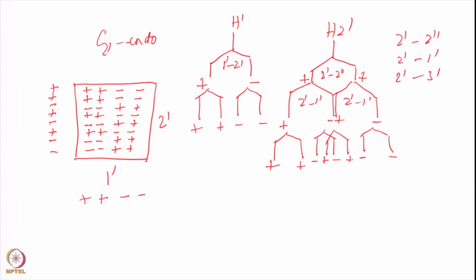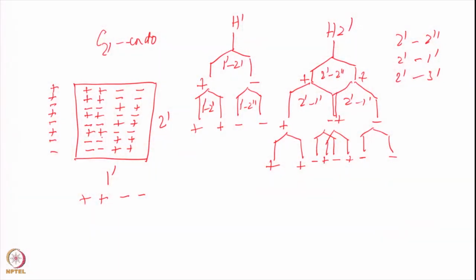This is the coupling, this is the 1' to double prime, 1' to double prime. So by looking at these plus minus separations, you can figure out what the coupling constants are in each one of those. Okay. But often you may not be able to resolve the peaks in this manner. So what will happen? There will be cancellations in the middle, all pluses and minuses will cancel in the middle, then you may not be able to find all the peaks. So in such a situation what do you do? When we do not have this, of course you will have to calculate all of this. Similarly you can calculate the fine structures for the 2', 3' peaks, and then the 3', 4' peaks.